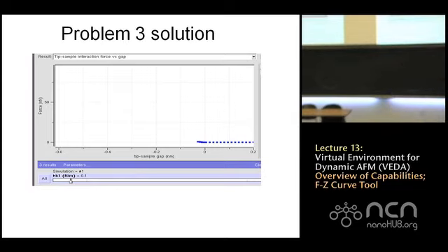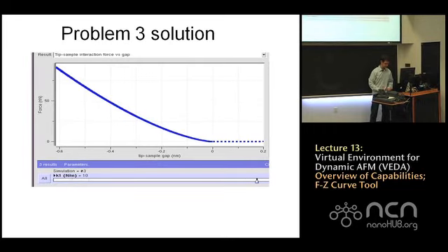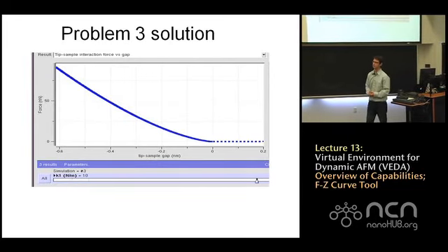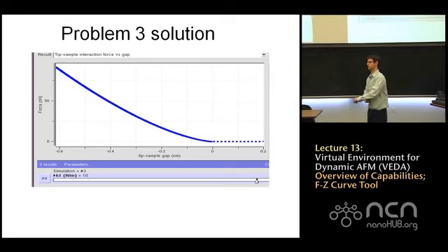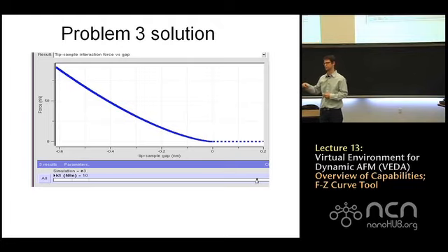And so let's just look at the other extreme. If we use the 10 Newton per meter cantilever and we traverse the same base displacement, we'll be measuring much more reliable data on this curve. So we're actually indenting the sample, and we're actually measuring data that has to do with force versus tip sample gap at this point. So these are two sort of extremes.